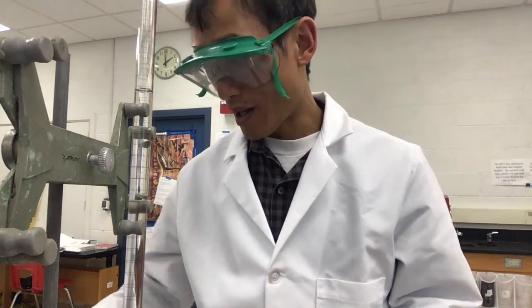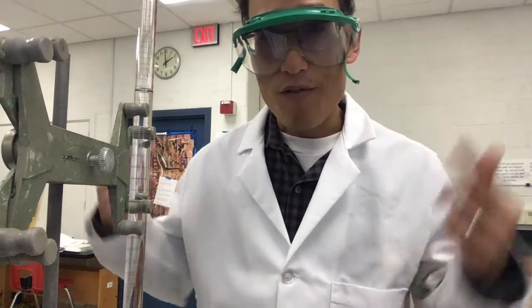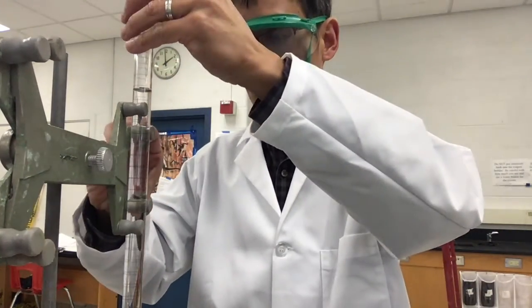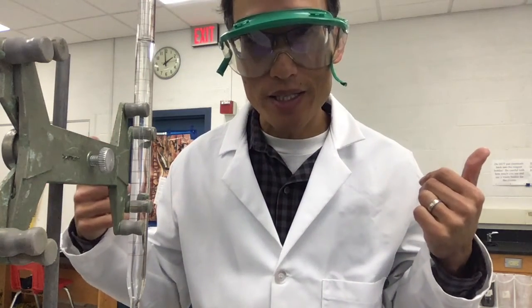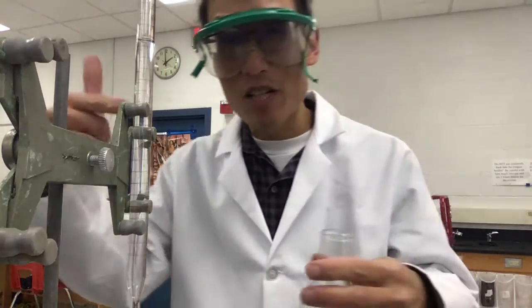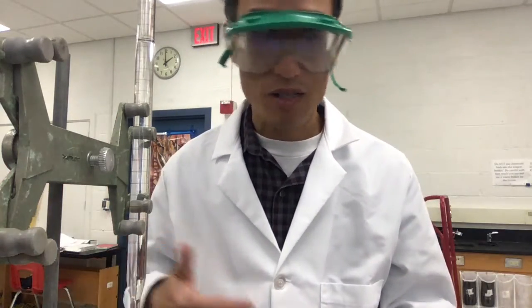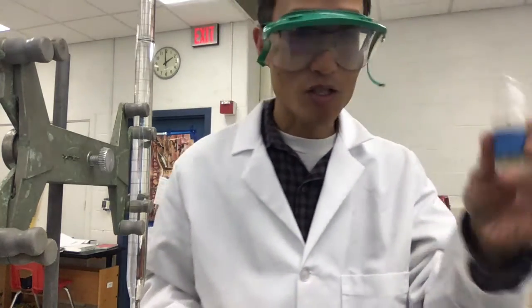What they have you do in the simulation is a quick run first. You do a fast run to see where approximately the end point is. The end point is the point at which they've all reacted. And now you're probably wondering, well, I have a clear liquid here and a clear liquid here. How can I tell when they're done reacting? The way we do that is we use something called an indicator. This is called phenolphthalein.